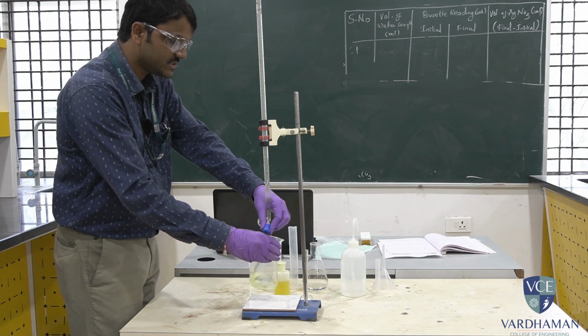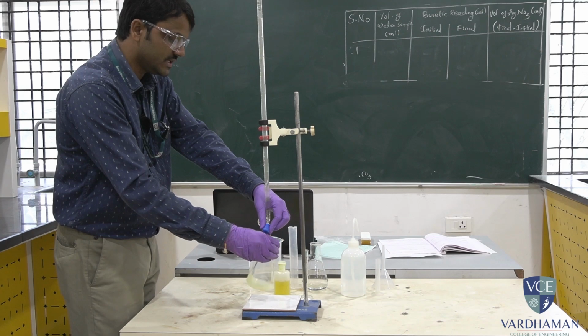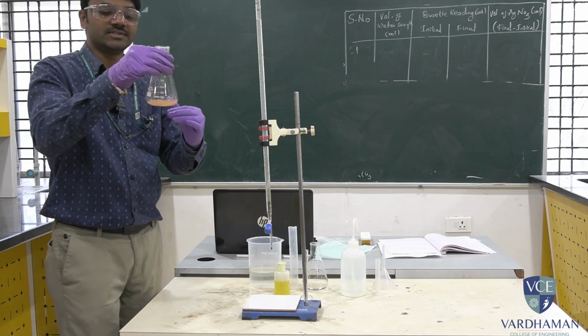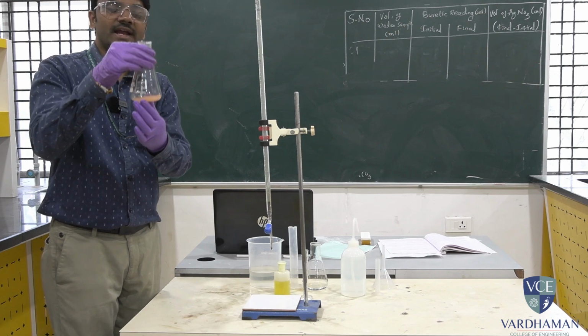As we discussed, an initial white precipitate is observed because of the formation of silver chloride. As you see, there is some white precipitate, and once all the chloride ions are consumed, after addition of an extra drop of silver nitrate, there is a formation of brick red color. This is the end point.